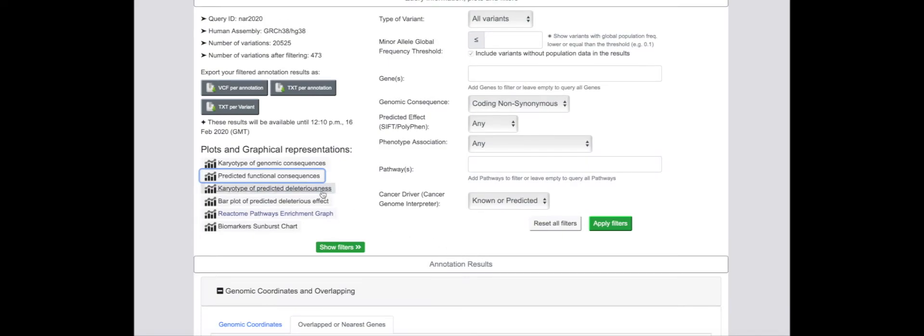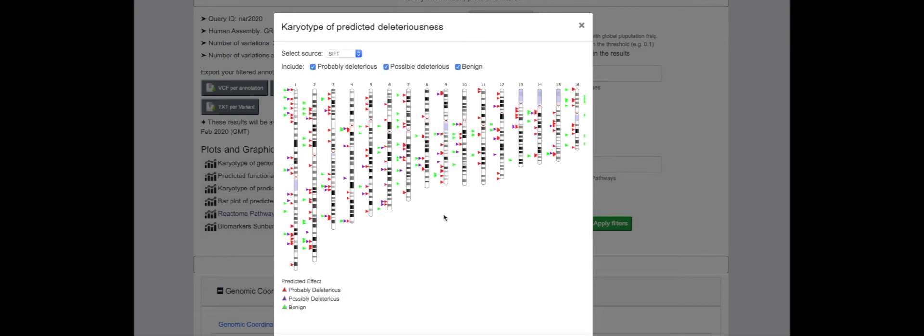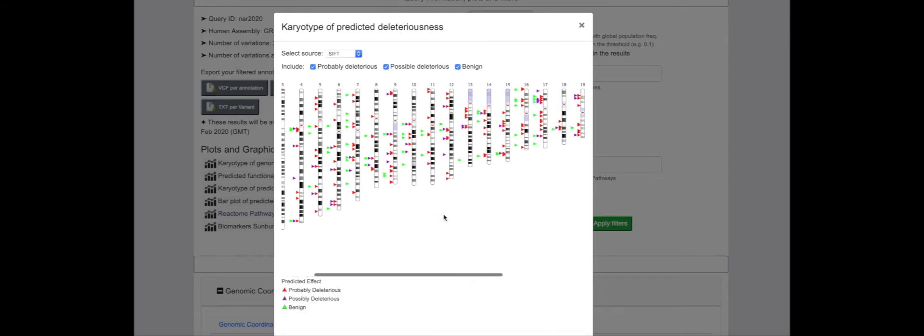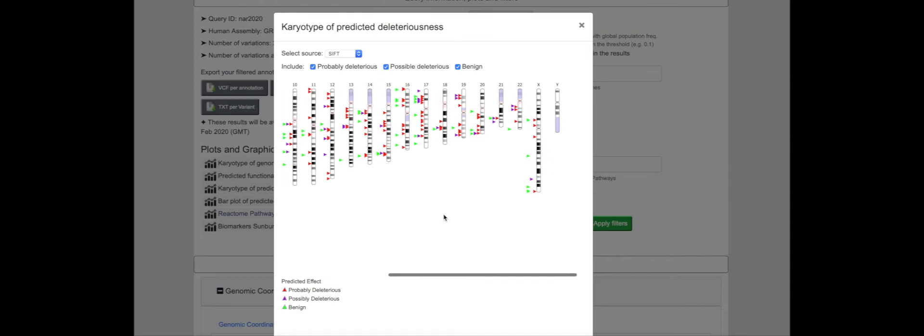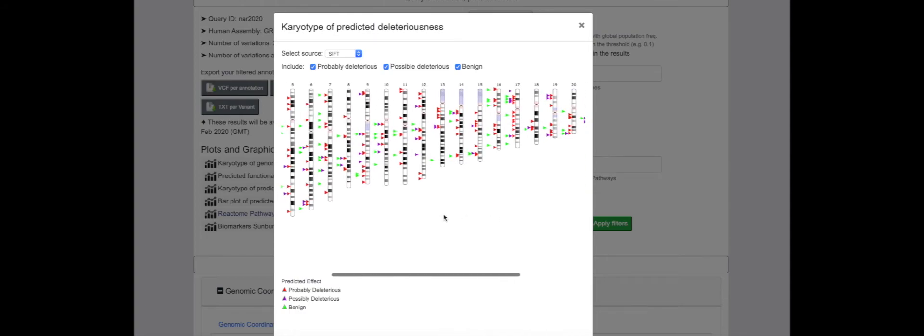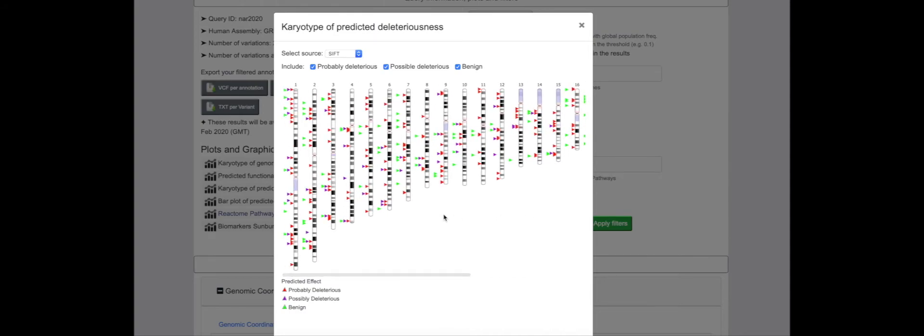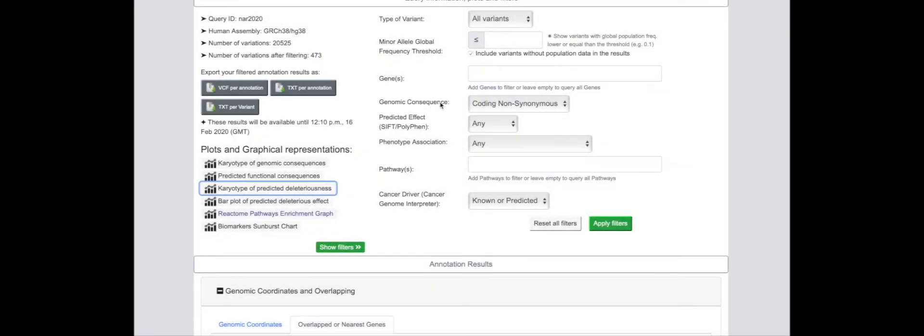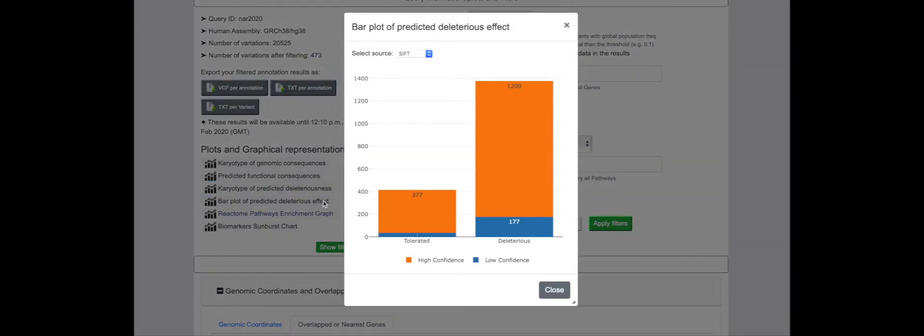Functional predictions for coding sequence variants can also be visualized on the karyotype plot diagrams, again allowing for clusters of deleterious variants to be easily identified. These consequences can also be viewed as a bar plot.